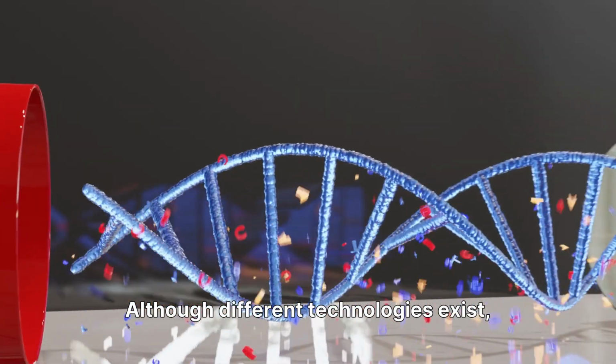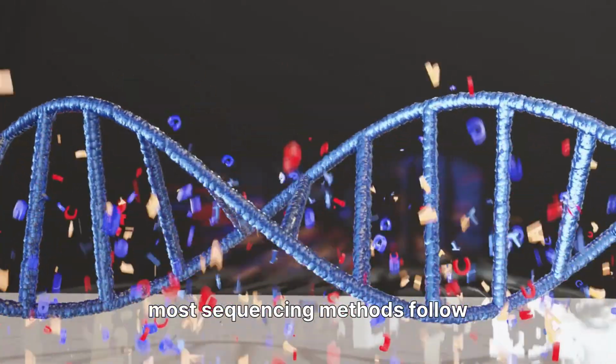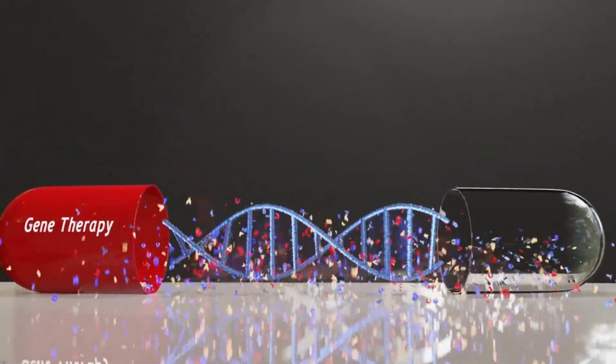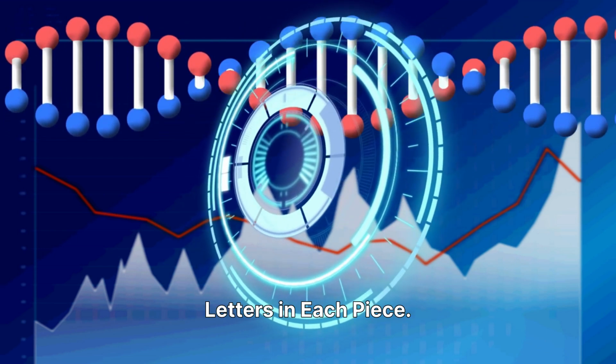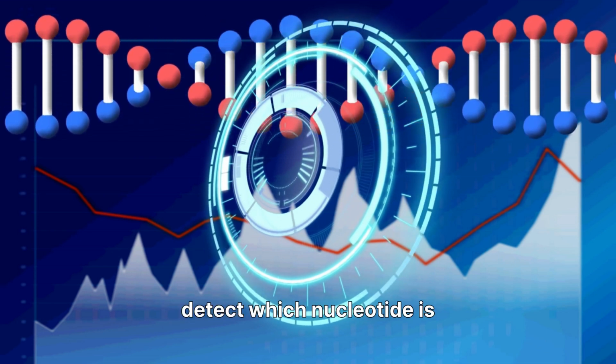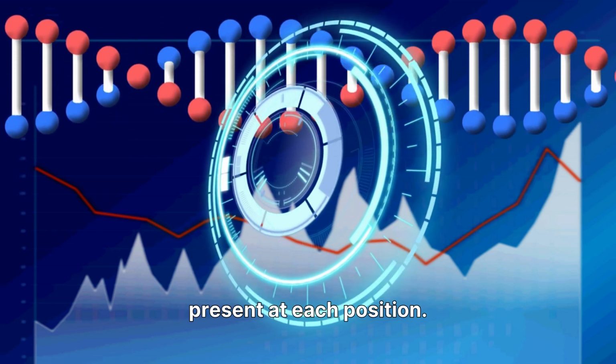Although different technologies exist, most sequencing methods follow three main steps. Break DNA into small pieces. Determine the order of letters in each piece. Chemical or optical techniques detect which nucleotide is present at each position.